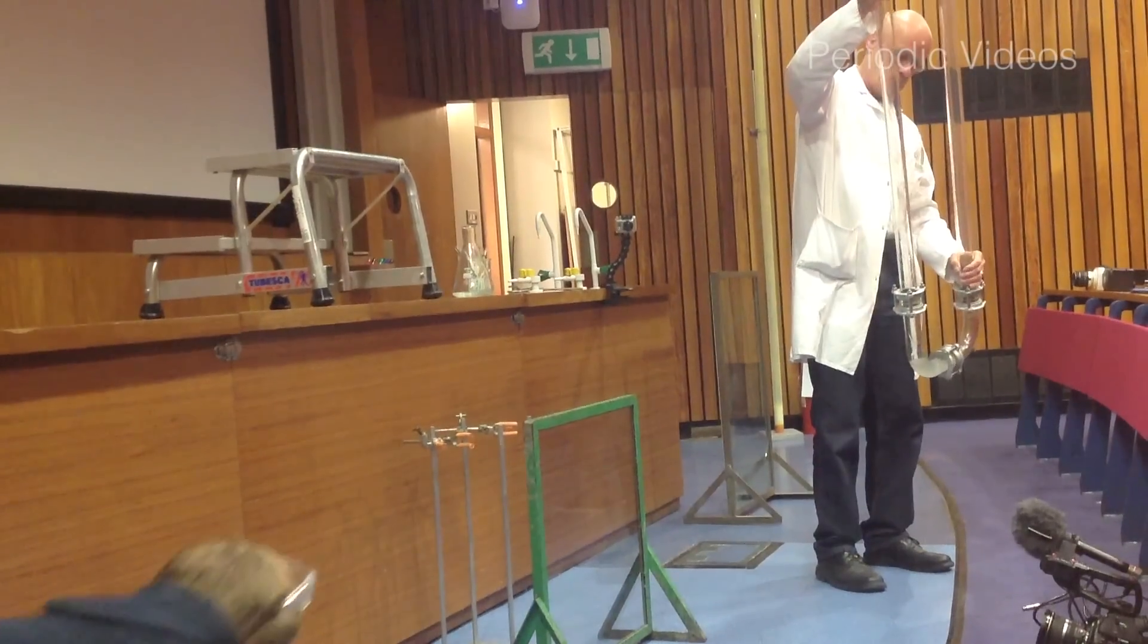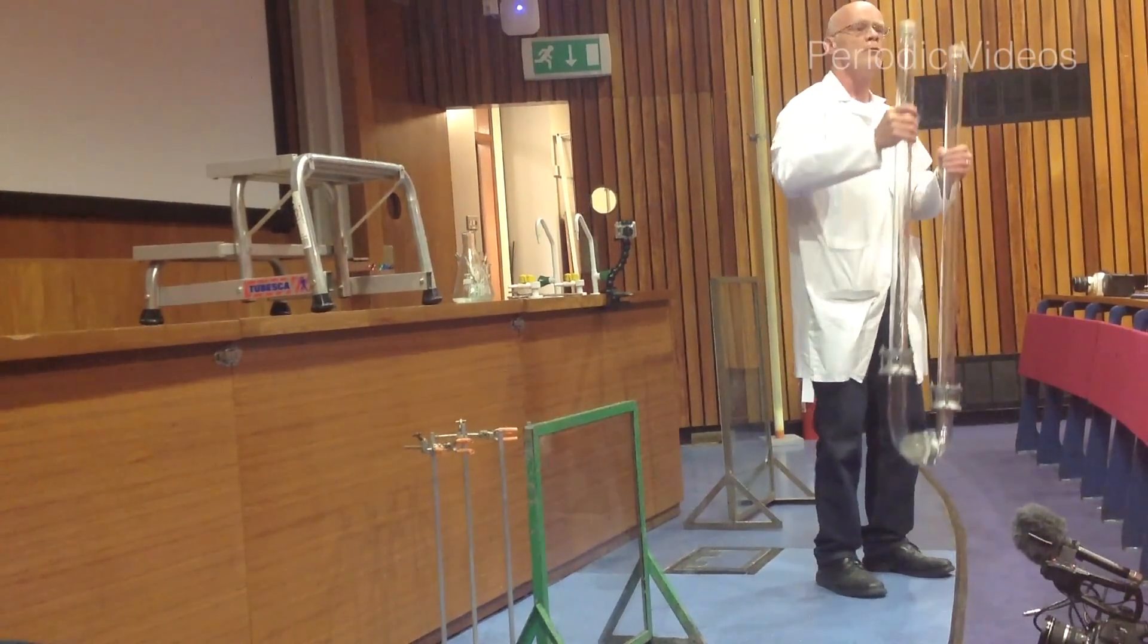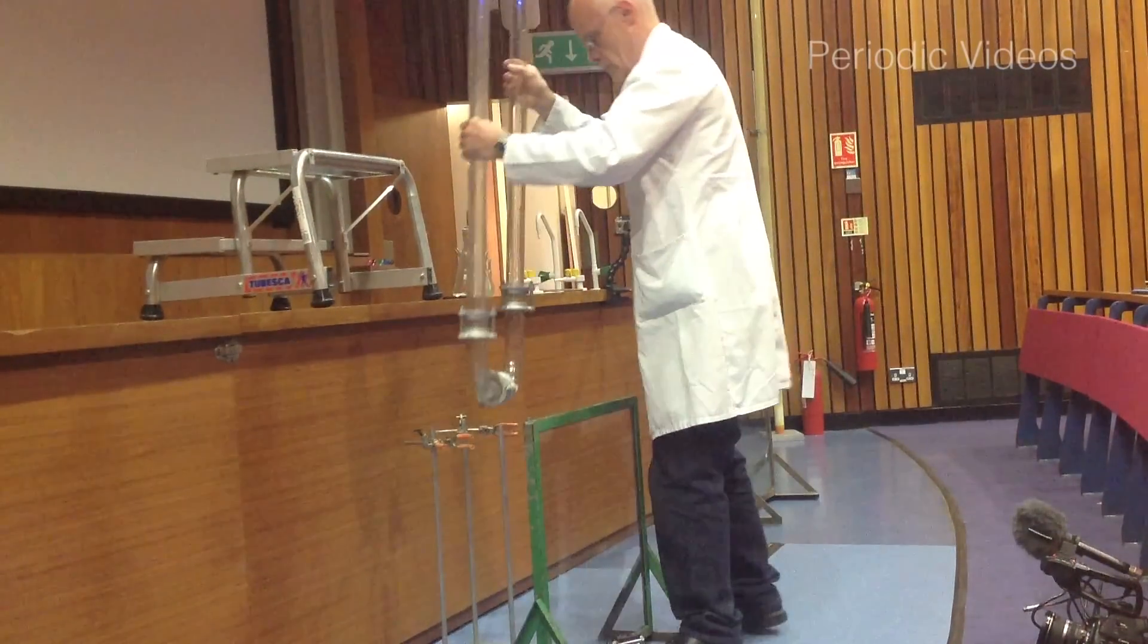So, the first thing was to persuade Neil that we could actually make a YouTube, because bending fat glass tube is very difficult. And in fact, he assembled it from pieces glued together.